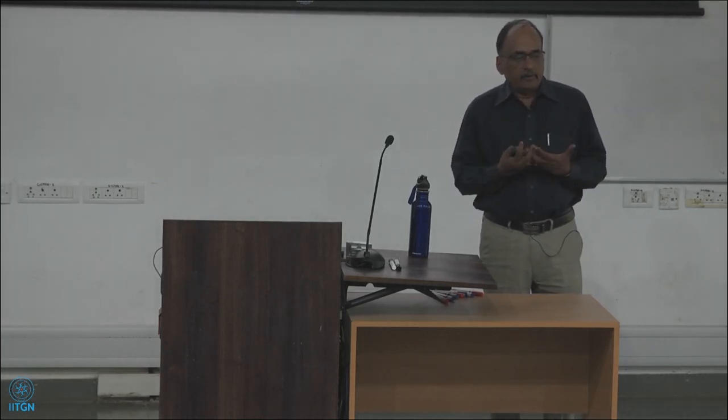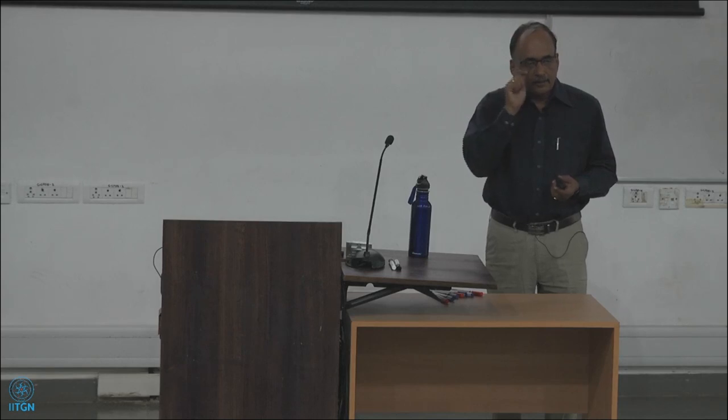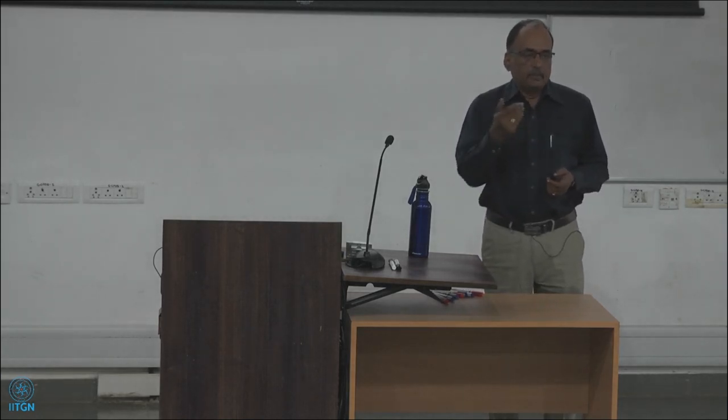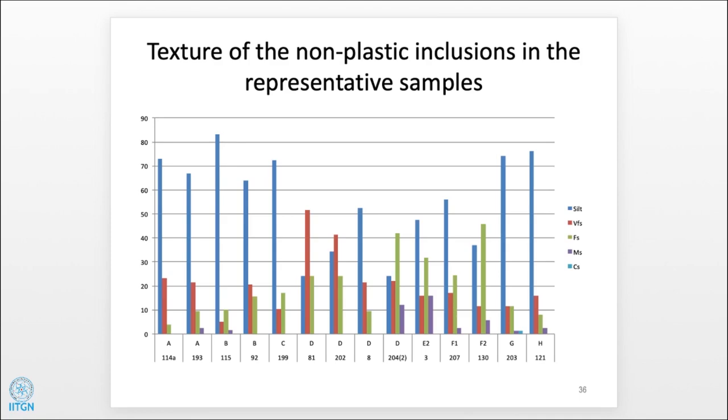Actually, when you collect clay and refine it, and when you make it, without addition of anything like that, depending on the intensity of the preparation, you get either unimodal or semi-bimodal. But only when you add sand, extra sand into it, you get bimodal. So that is one thing which I learned from my ethnographic surveys and doing this thin-section analysis. So the same method was applied here. That is why I do not have any main groups here, but I'm sure that mineralogically E, F, G, H, all these are different.